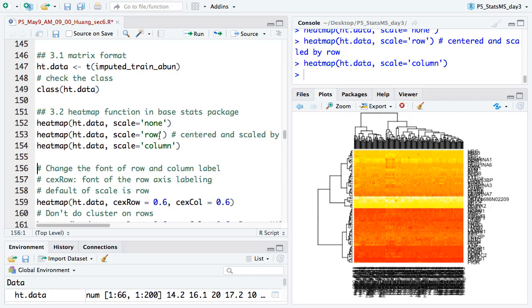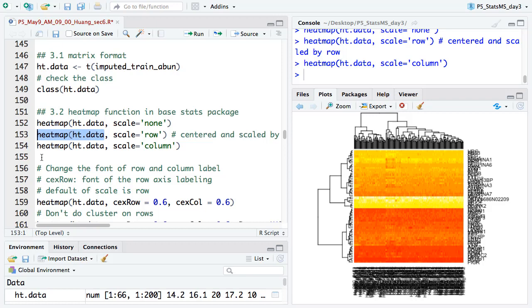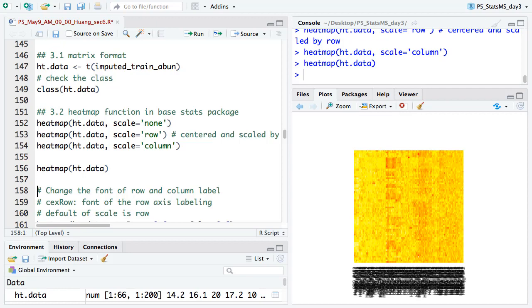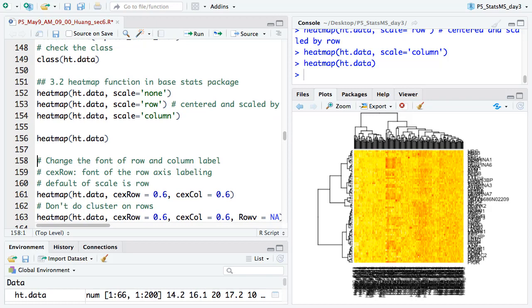For this simple heat map, you can change parameters. For example, maybe you only want to cluster for samples, not for proteins. You can set the Rowv parameter to FALSE — that means don't cluster by row. Then it will not cluster the proteins (rows), only the samples (columns). You can still see there are two fairly clear clusters for the samples, which correspond to our two conditions.